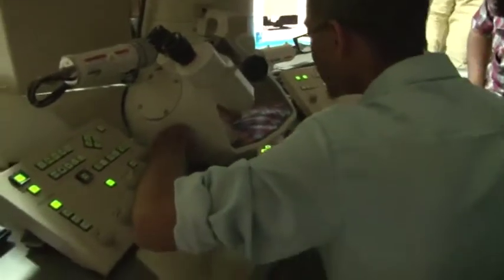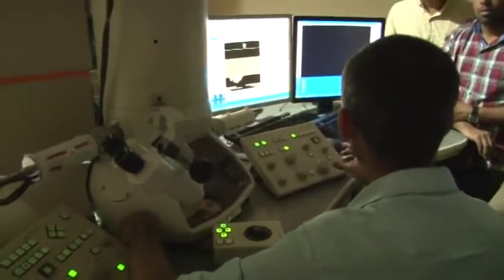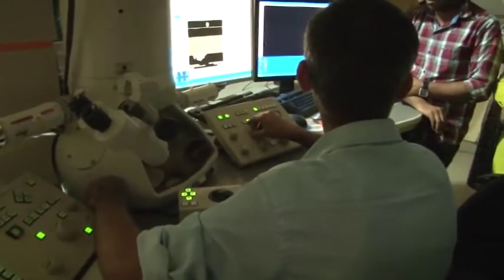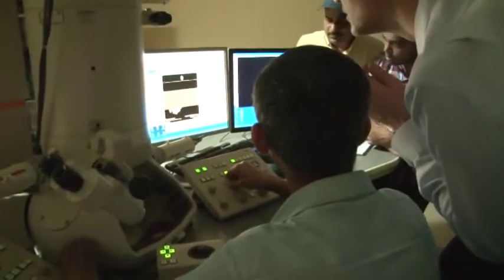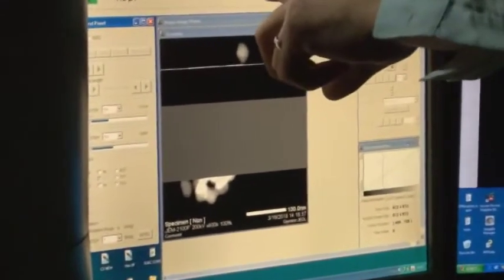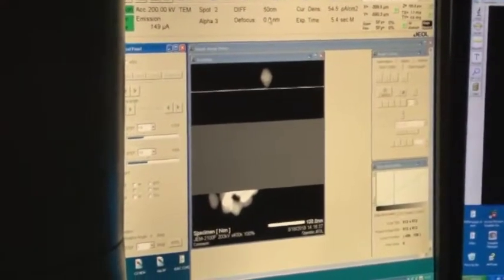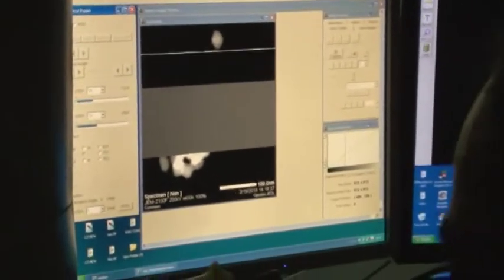Did you change the camera length? I did it, yeah, because it was a pretty small camera length. Okay, so let's go to higher. This is 3.4. Further, it's just, I think that's where, oh yeah, 0.3 meters now. Usually we work with 0.2. No, I mean, just for the demonstration, go up to like 1 meter or something. Even further. So now just refocus and then it should be okay.